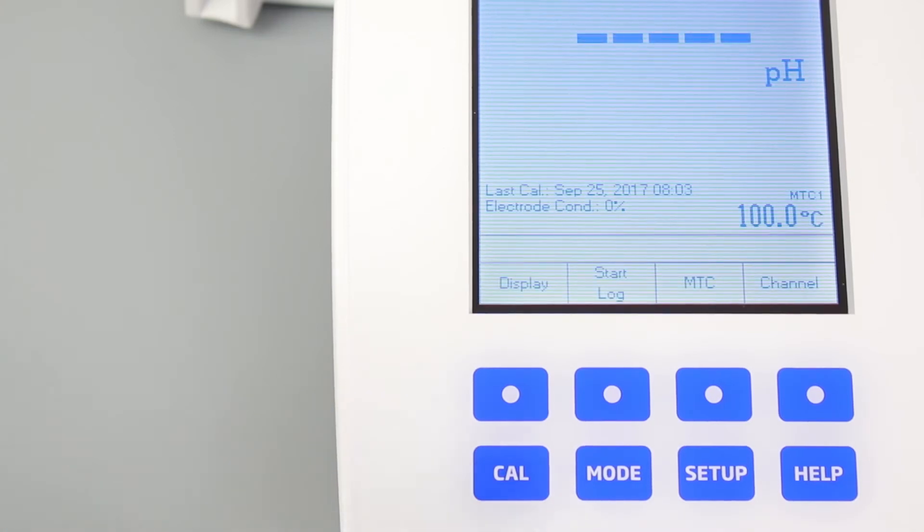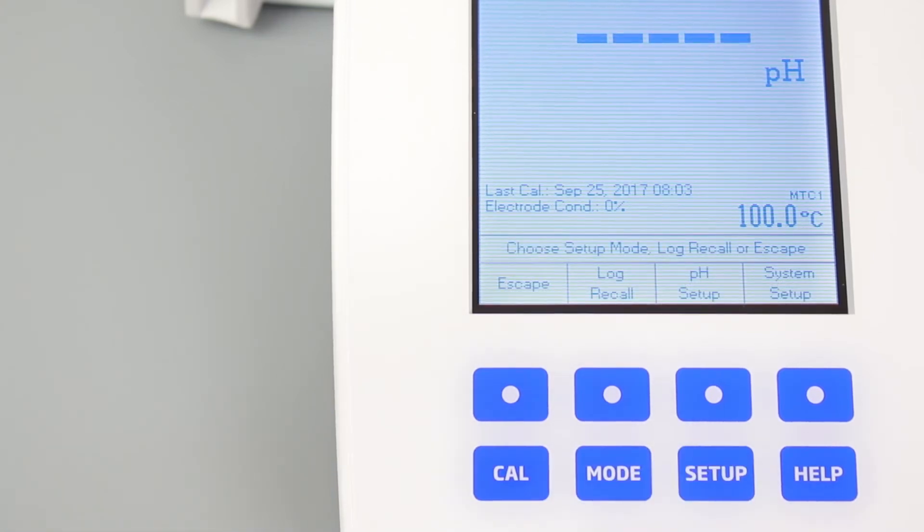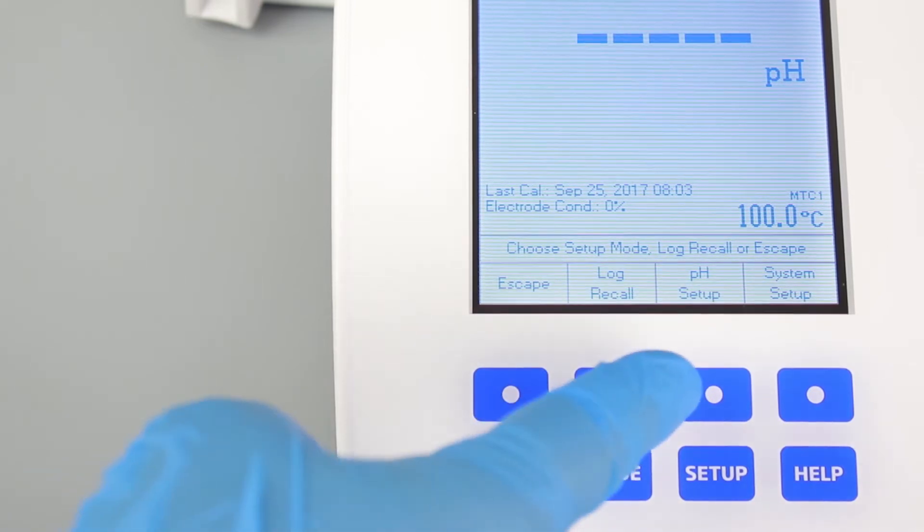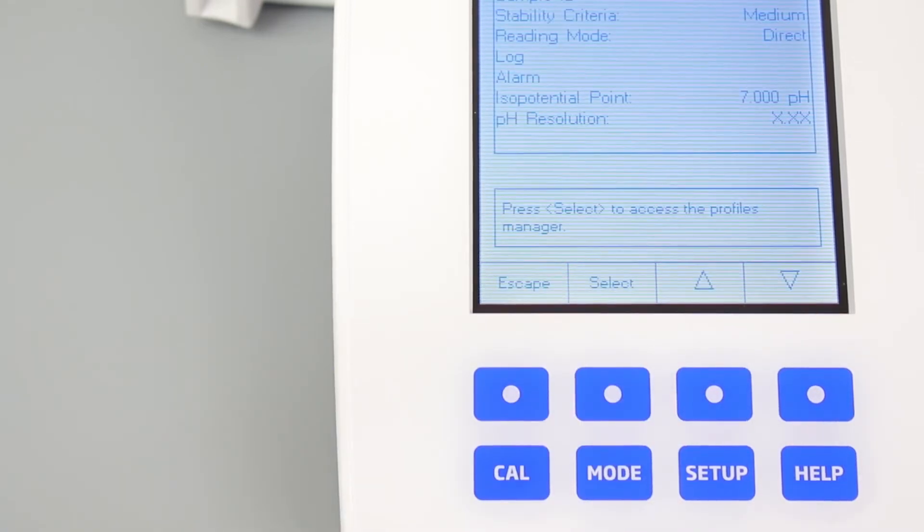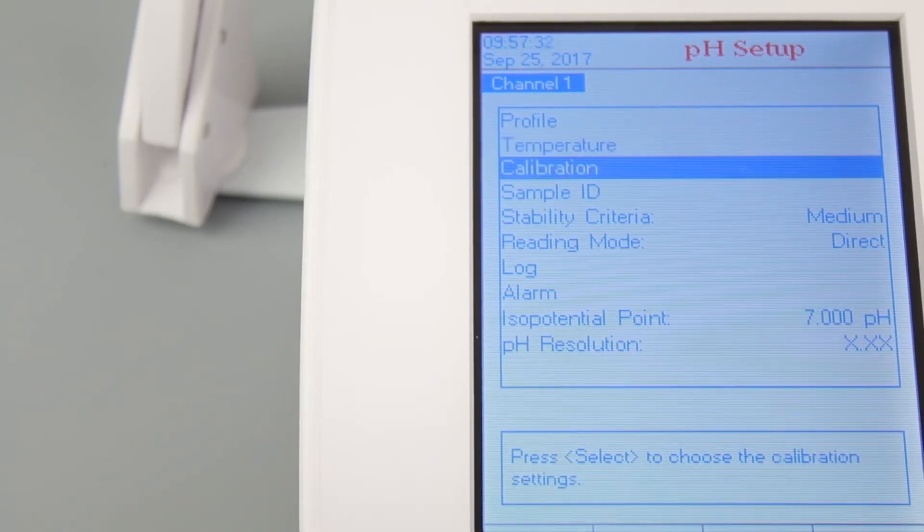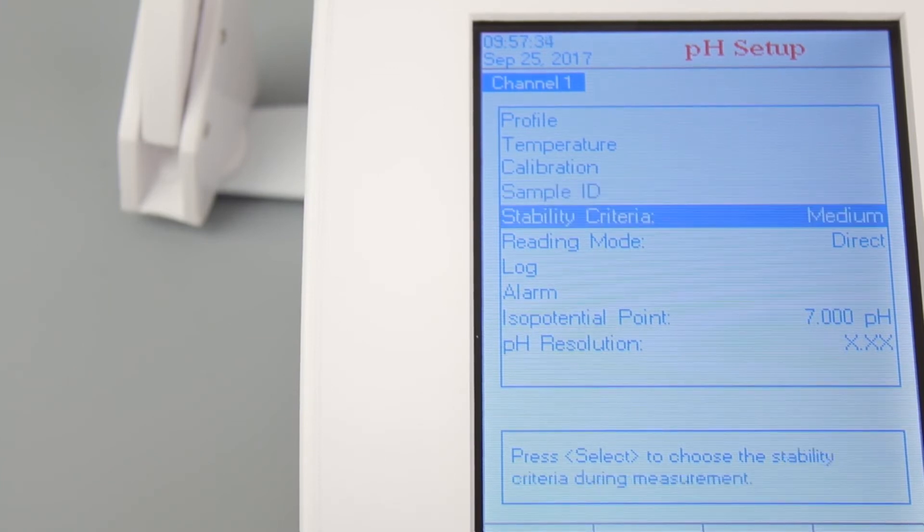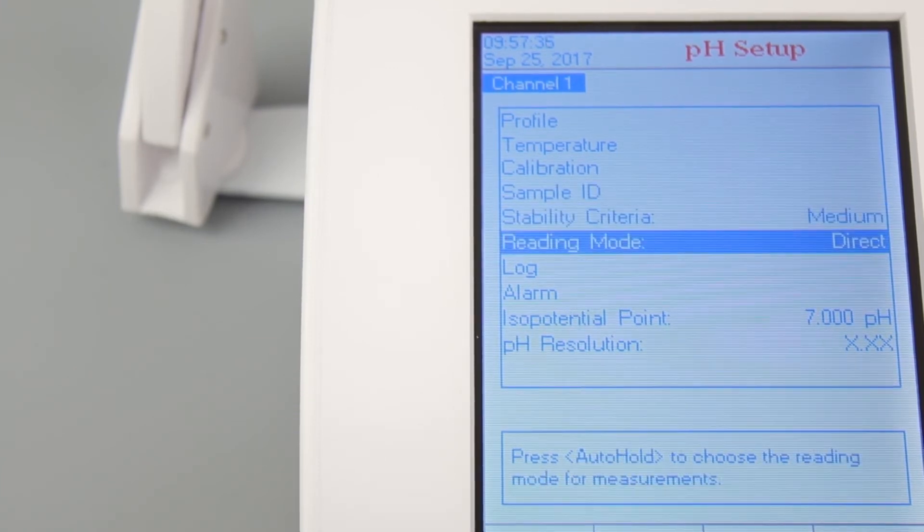Once you have set your preferences, hit ESC, SETUP, and then pH SETUP. This area of the setup menu is where you can change your temperature compensation settings, calibration preferences, and calibration reminders. The pH SETUP menu is a great way for you to ensure best practices for your lab are being followed.